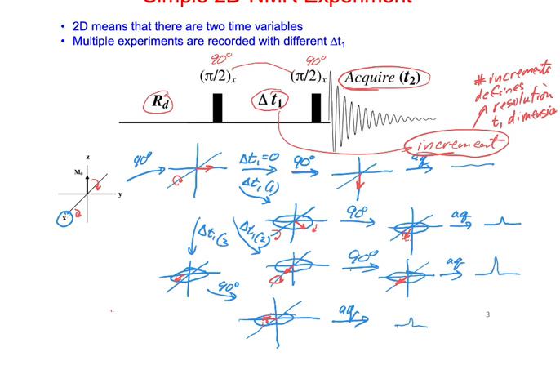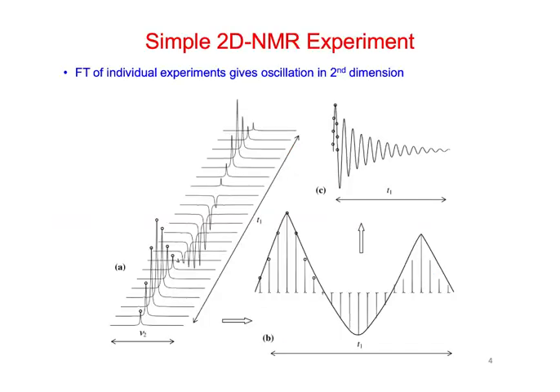But, so in general, which one is this? And if we look at that series, let's look here in A, we get some small peak here. It got bigger and bigger, and this was where it was precessed to 90 degrees was the maximum one. It's going to go back down. It's going to go through a 0, negative, positive. So it's just alternating like this, right? So if we look at this from the side, we're going to see something like this, right? We started small, we got bigger, we're going smaller, negative like this.